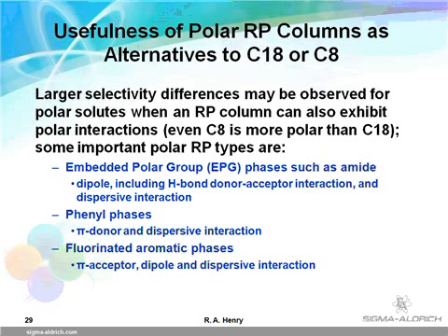Nonpolar solutes with alkyl character will usually be retained and separated best with alkyl phases. If a separation looks promising on C18 but still requires optimization, small changes in the mobile phase should be investigated. Changing to a C8 column should also be investigated. Polar solutes may be retained and separated better on a stationary phase that includes some built-in polarity, such as an amide, phenyl, or pentafluorophenyl phase. Ionic solutes may require phases having ionic character for best results.